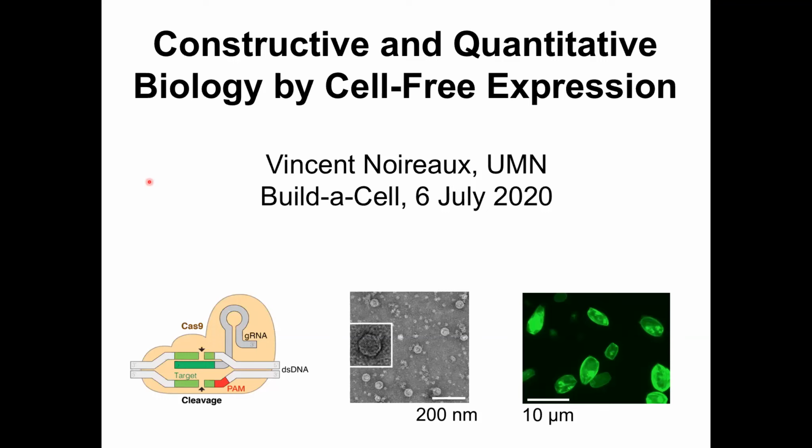I'm going to give a presentation on cell-free expression and how we use it to construct biochemical systems in vitro. And I will pass relatively quickly on the first items to focus more on the synthetic cell or minimal cell systems. You see some images at the bottom here.